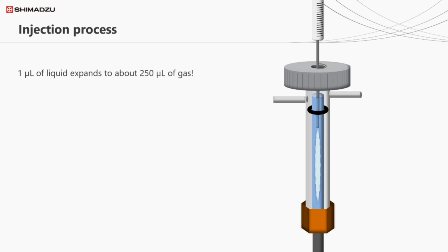It's absolutely critical that the volume of gas created is less than the internal volume of the liner. I cannot stress how important this is. A typical liner has a volume of around 500 microliters. Actually, that's not true. It's usually a bit more, around 700 or 800 microliters. But to simplify the maths and the calculations, we're going to work with 500 for now.